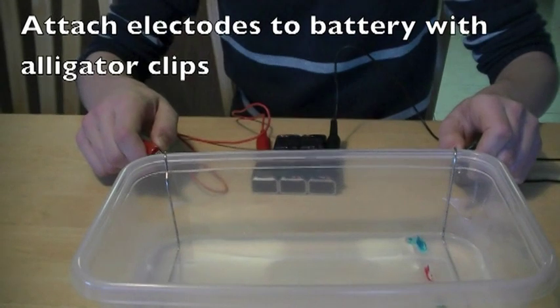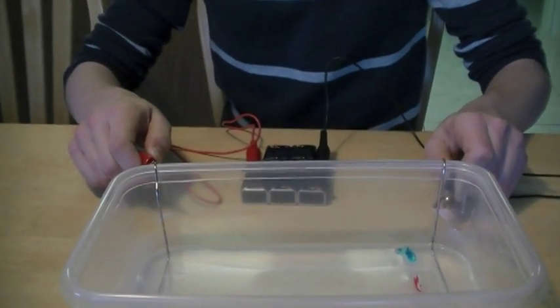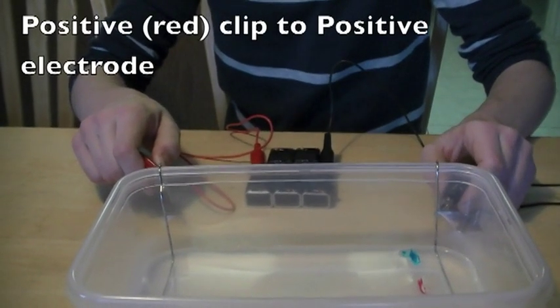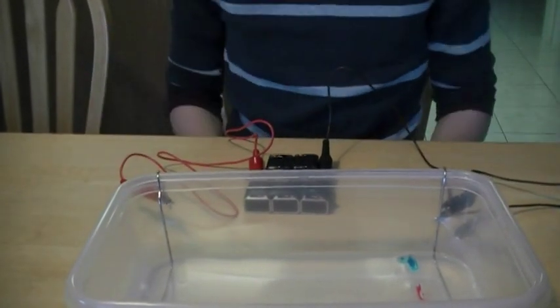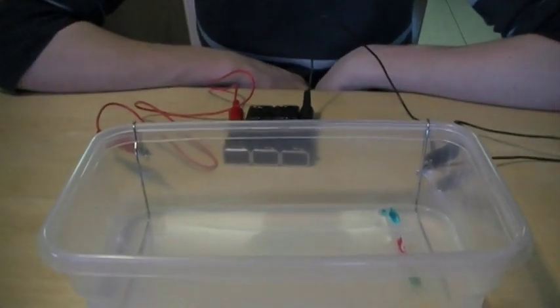Using the alligator clip leads, attach the battery pack to the wires resting on the gel chamber. The positive terminal of the battery pack should be connected to the positive electrode. This is the electrode towards which you want the food coloring dye to migrate as it separates. You should see bubbles forming around the electrodes in the buffer as the current passes through them.